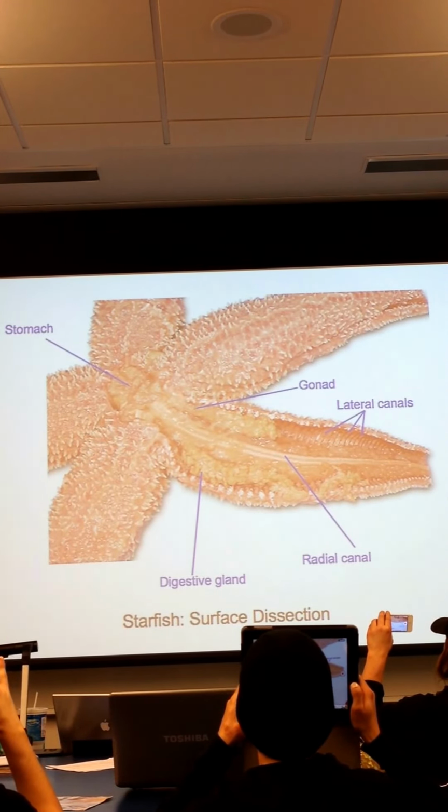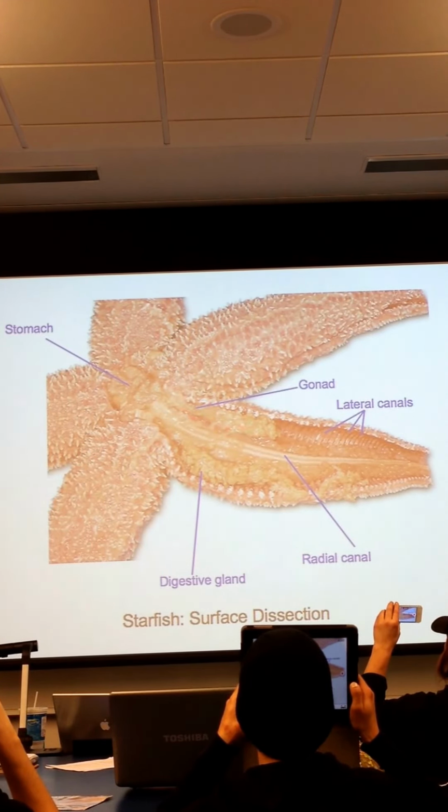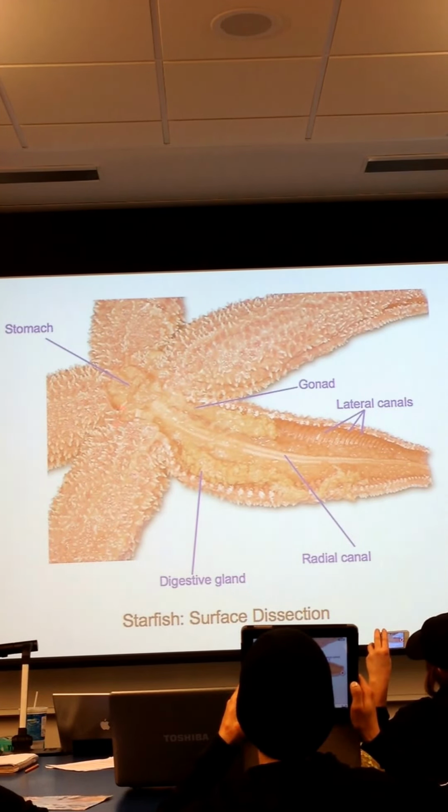In your starfish, they look quite different, right? The gonads were much smaller in the Tuesday lab. They were a little bit more red in appearance. But in the Saturday lab, we actually saw a few that were big like this. Okay? The digestive gland is grainier and cellular, kind of more of a brownish color in the starfish that we have. It's kind of hard to see in the picture, but you can. These guys look more squishy and soft. These guys are very distinctive and granular and brown color. Okay, that's it for this picture, guys.